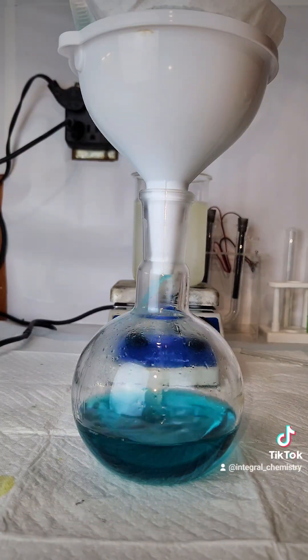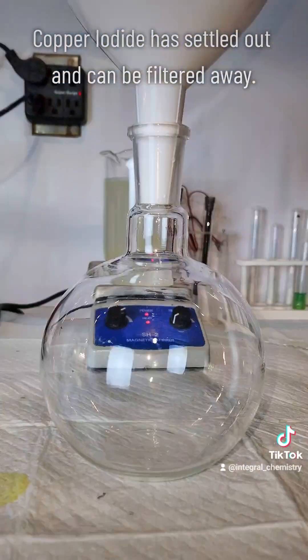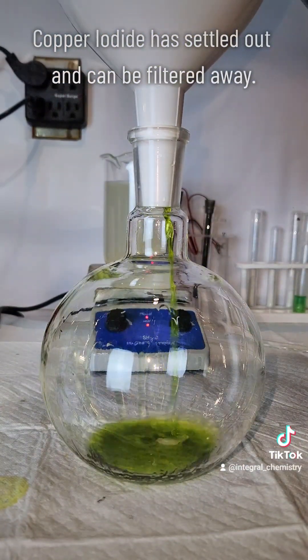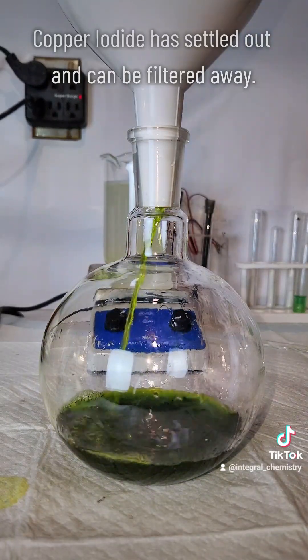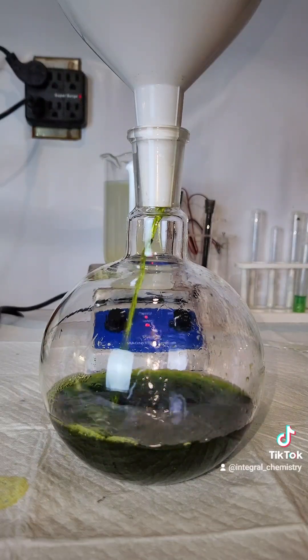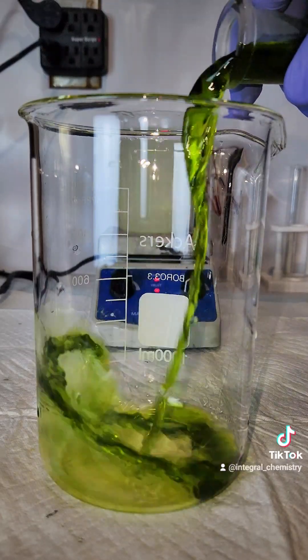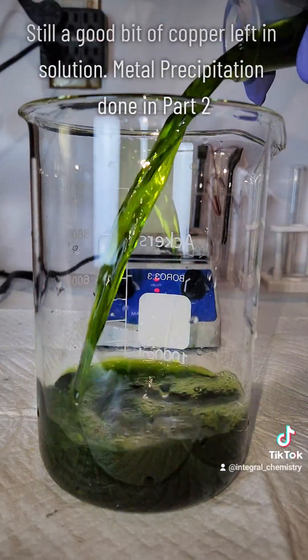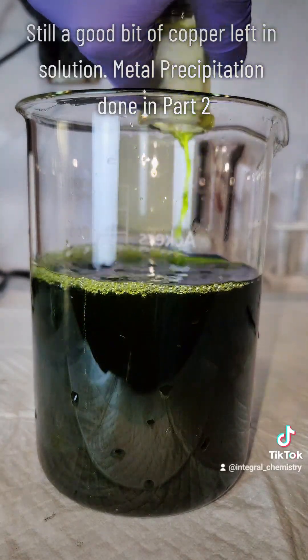While this is going on I check on my copper iodide solution and I can see that all of the copper iodide has settled to the bottom. I filter this off the same way I've done with the last couple samples, and once this is done I transfer my filtrate to another beaker. That's the end of part one — follow to see me separate out the pure copper and nickel metals from solution in part two.